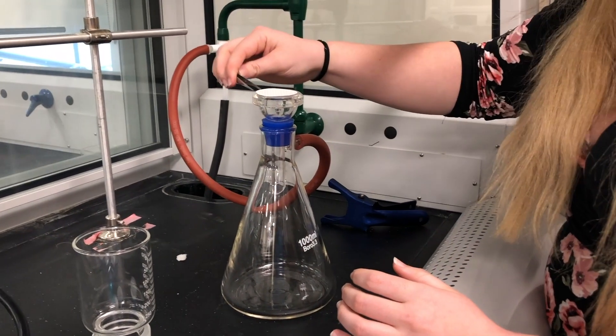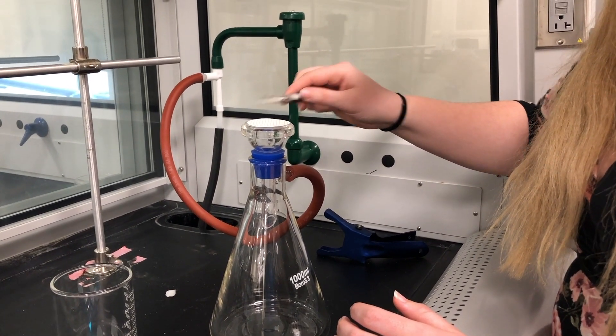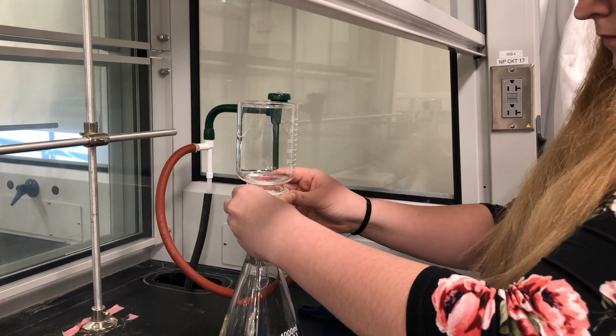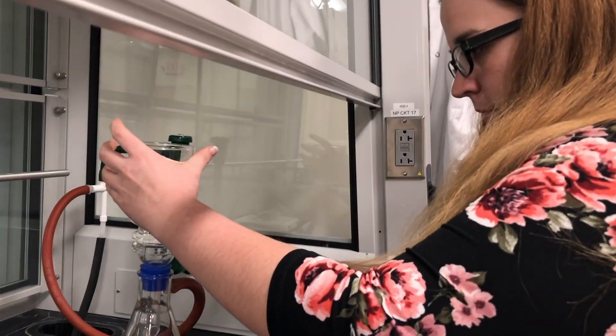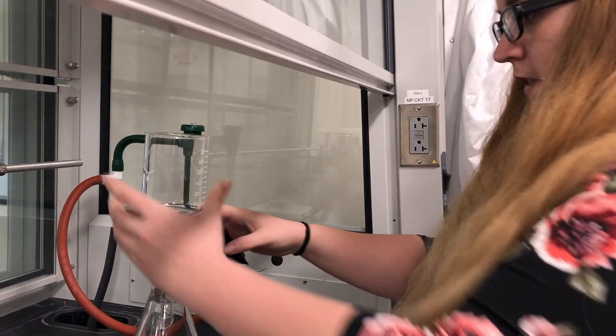You can adjust the filter to make sure it's on there, and then you're going to take this piece and set it on top. You want to make sure this has a seal, so take the clamp and make sure that they fit together nicely to get a nice seal.